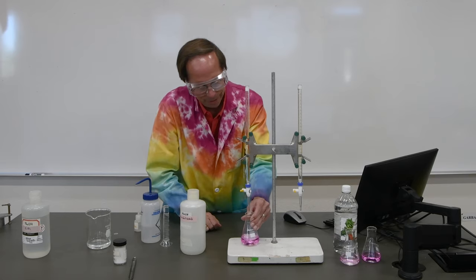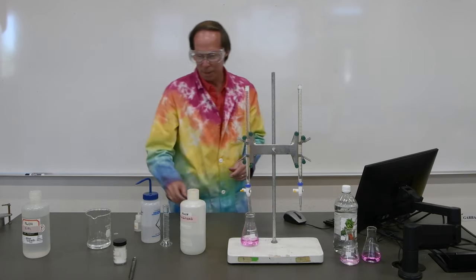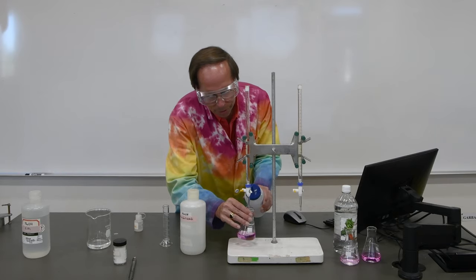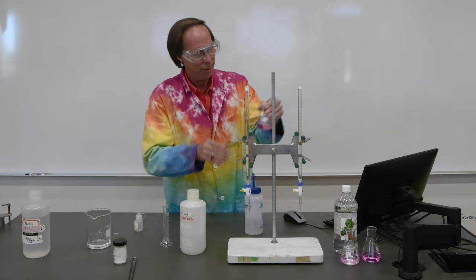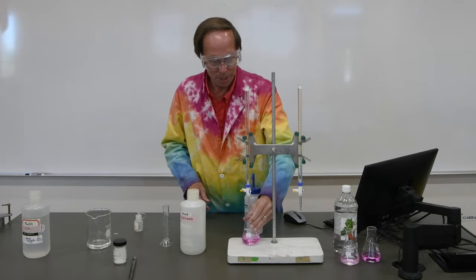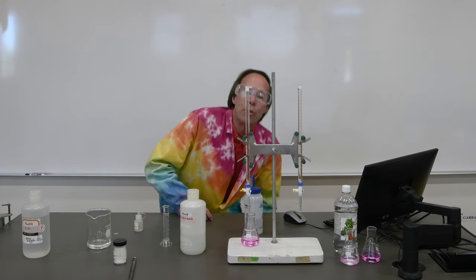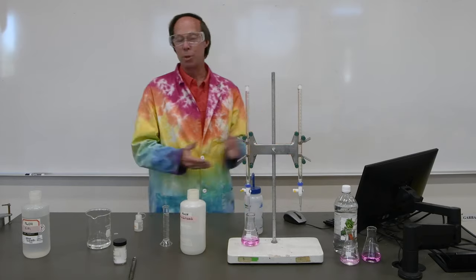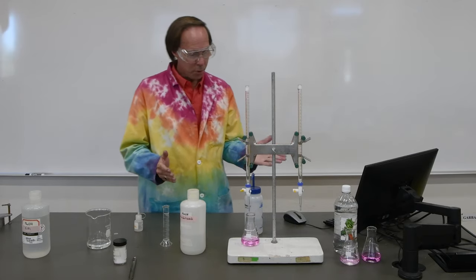There we go. That looks like it may last. We'll just be sure and put that little last drop in there. But it looks like that lovely pink color is staying, and it appears that the volume is very close to what we got in the previous two trials. So I think we're good to go.